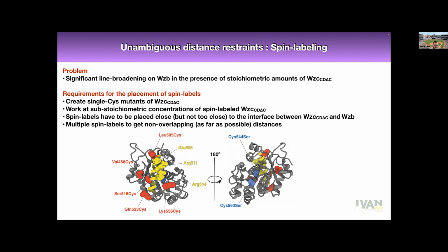As I say, for structure determination, NMR is a complicated problem, at least in solution, in that there are two issues. The first is that you do not have a 1:1 linear transform between your experimental data and your positional data, like you do in crystallography, where the two are related by a simple linear transform, the Fourier transform. And the second is that there are many complicating issues which arise because of this lack of 1:1 mapping between your data and your atomic positions. So it is what it is. We've been dealing with this sort of thing since we started doing structures by NMR, so we're going to continue doing that. Okay, so this is the problem here.